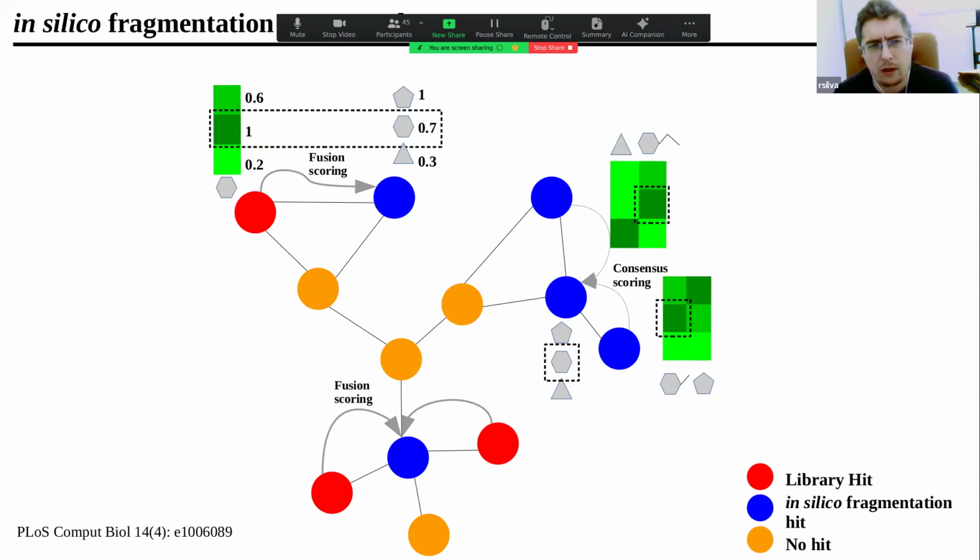I'm going to talk about the limitations, right? It's a combinatorial experiment. We generate a lot of false positives, but if you are careful to use it, it can be very useful. But there are some limitations here. The first one is that this approach, we only looked at the direct neighbor, the first neighbor of the node. And the second one is that there was a very heavy application.